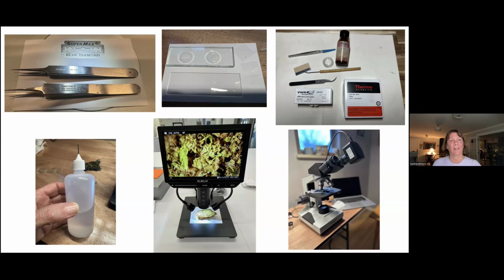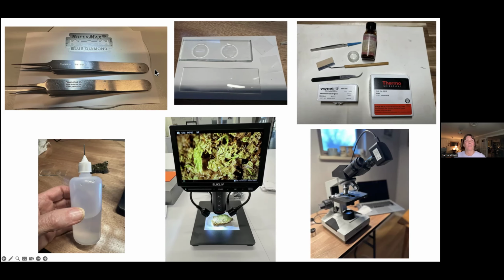They break very easily. I can't tell you how much money I've spent on these over the years. They're $35 a piece on Amazon, and I always have several in reserve because all it takes is one drop on the ground or one poke into the side of your microscope and it's ruined. I also use a double-bladed razor blade because I like the flexibility of it, but yes, I have shaved off many layers of skin off my fingers while doing that.